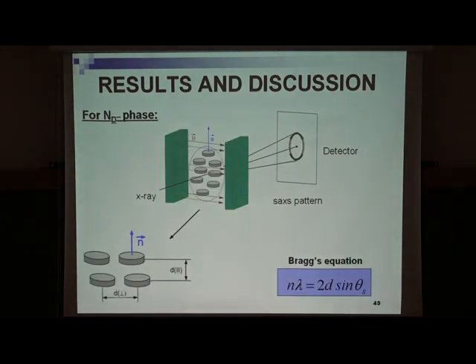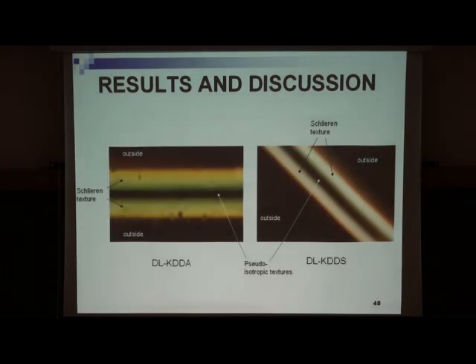Okay. In this case, you had a magnetic field applied? No, for ND phases we don't apply one. In this capillary, in this image you showed? No. There is no magnetic field for the ND minus phase. We don't use it.